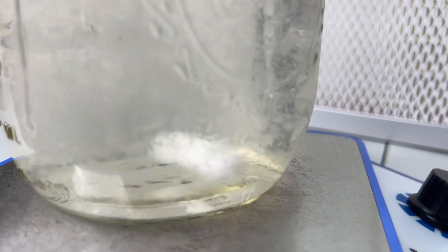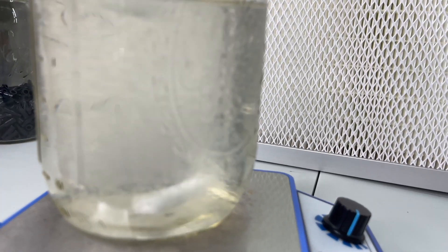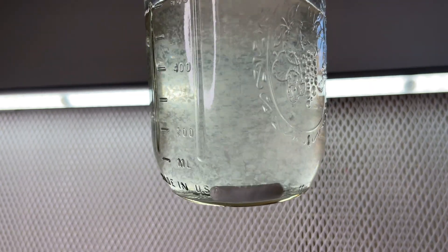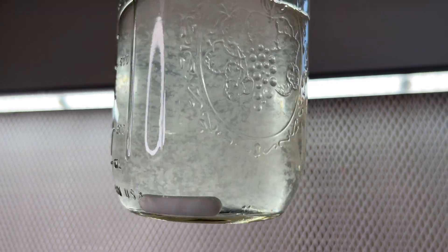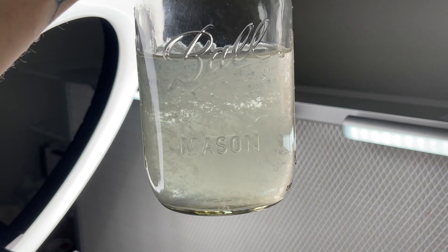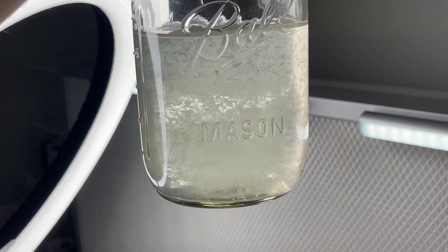After letting the jar sit in a room around 78 degrees Fahrenheit for one week the mycelium is already starting to propagate. After another week the mycelium has noticeably grown thicker.